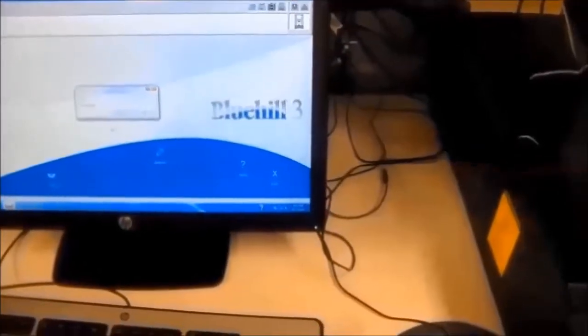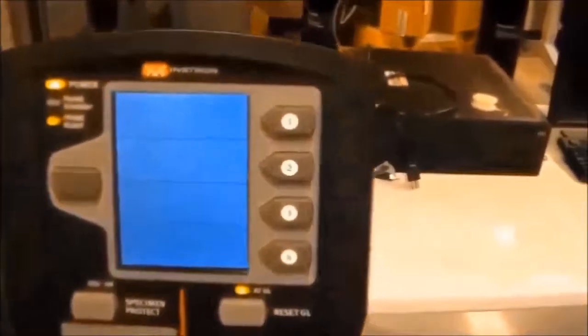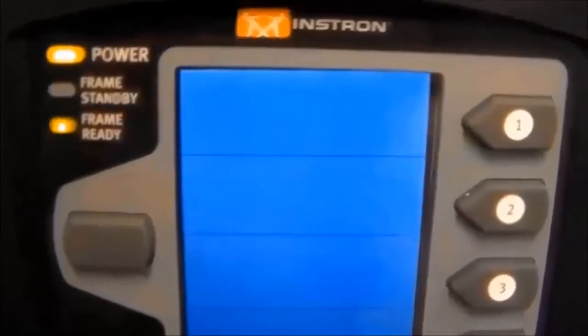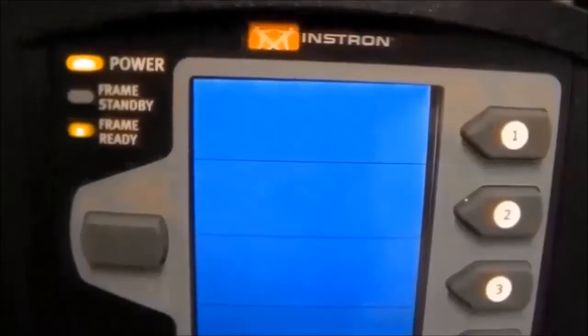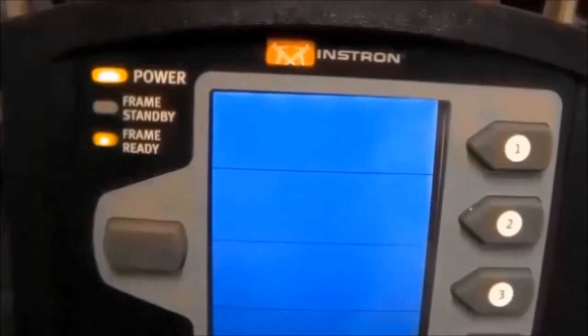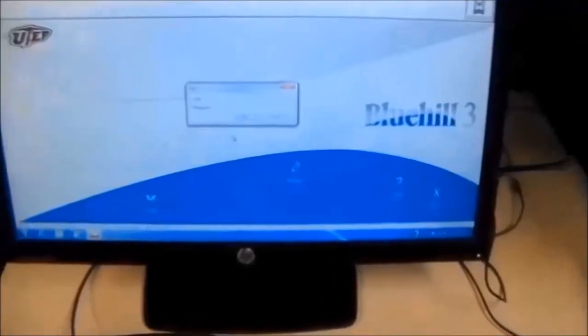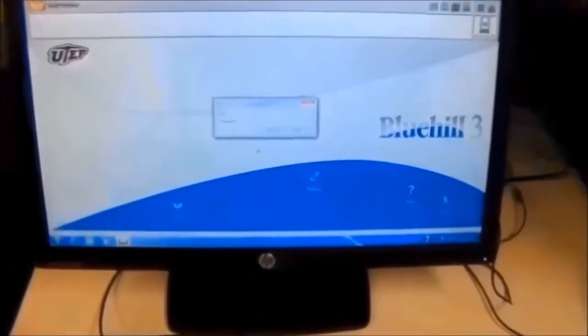After about five minutes, the software should be able to connect with the frame. The power light will be on and the frame will show it is ready, meaning the software and frame are connected.